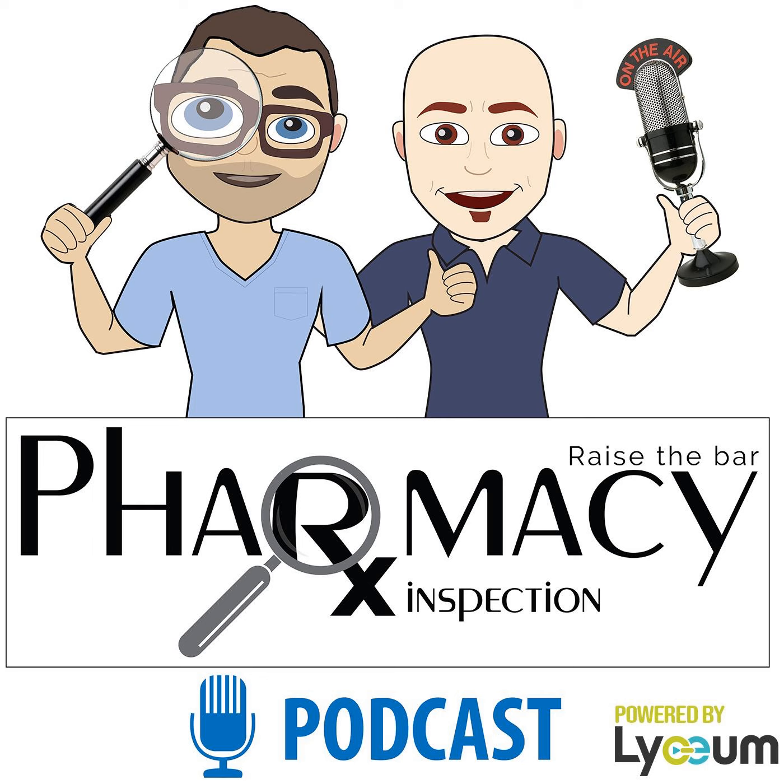In this 483, we define the problem as contamination: 15 CFUs, or colony forming units, were found in the ISO 7 buffer room in one particular location. In the measure phase, you're going to set up a way to collect data that will help you identify the root cause of the problem. In this case, the data measurement collection tool we would be using would be continuous air monitoring.